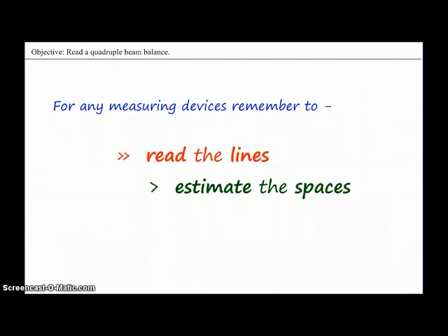When reading a quadruple beam balance, just like any other measuring device in the lab, it's important to remember this phrase: Read the lines and estimate the spaces. You'll see exactly what I mean by that phrase as we go through this video.